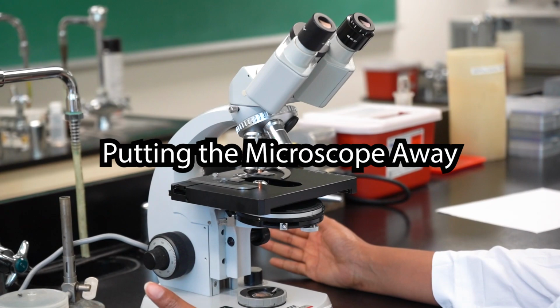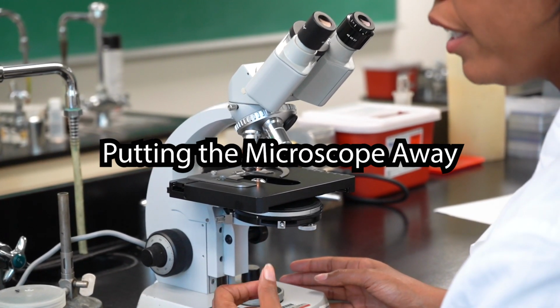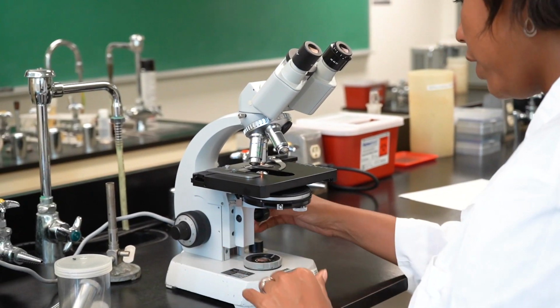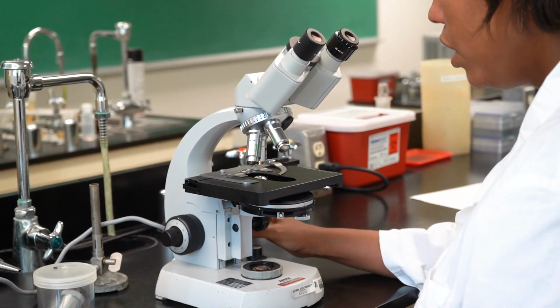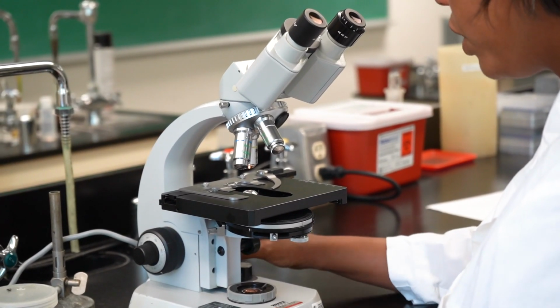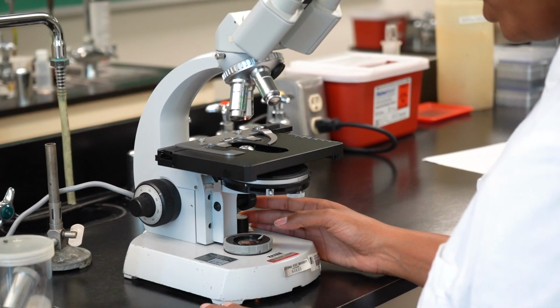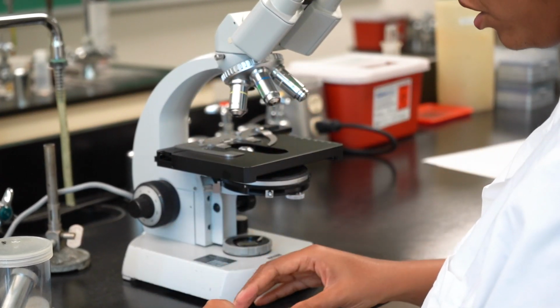All right, so when we finish using the microscope, we have to make sure that the microscope is properly put away. The first thing you want to do is lower the stage to its lowest position to avoid the possibility that any objective might collide with the lens or any of the components of the condenser. You're going to turn the lamp completely off, and you're going to move the objective out of position.